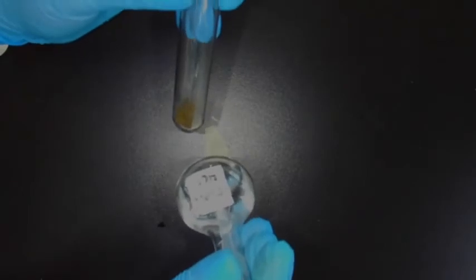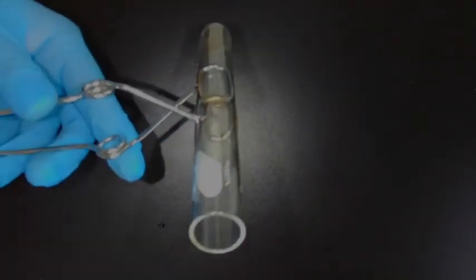I hope it fits. There. And we're going to add 20 drops of concentrated hydrochloric acid. Okay? So observe what happens to our iron sulfide.